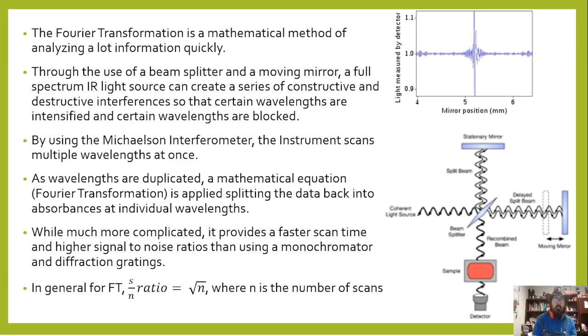You won't be able to know it unless you scan multiple times, which takes way too long. This way, if a cosmic ray hits during one scan, it's going to be averaged out as it looks at that wavelength multiple times through a whole series of different tests. So it helps stop instrumental error, essentially.